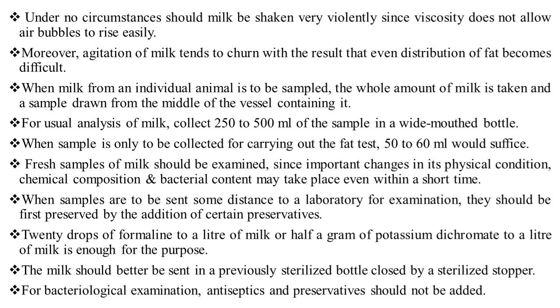In our today's lecture we are going to talk on milk quality analysis. The milk analysis is how to check the quality of the milk. Under no circumstances should milk be shaken very violently since viscosity does not allow air bubbles to rise easily. Moreover, agitation of the milk tends to churn it, with the result that even distribution of fat becomes difficult.